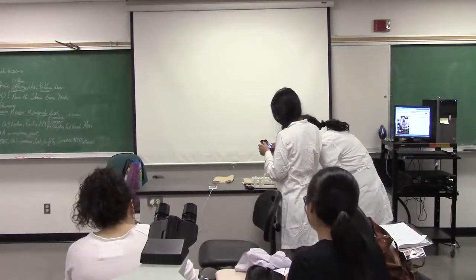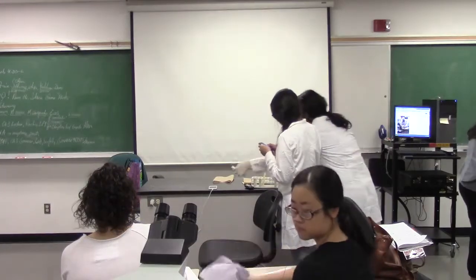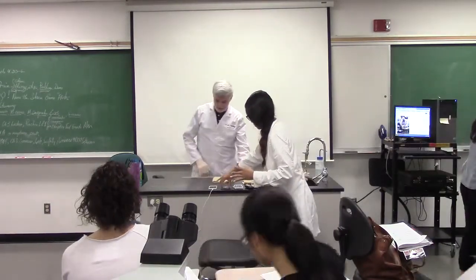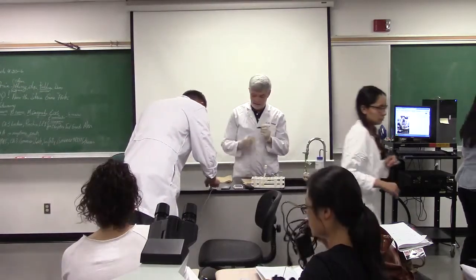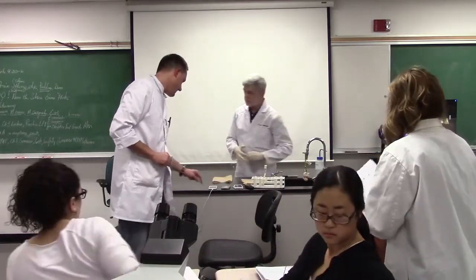So tonight's the Endospore stain. Is it going already? Yeah, I went ahead and turned it on. I'm going to go over several things with you, like the agenda, etc. And we're going to do everything Endospore tonight.